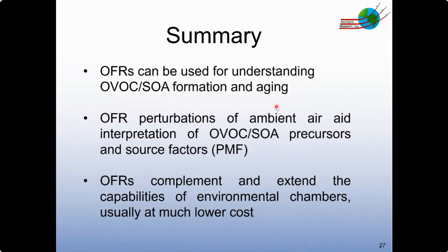For a while, there was some contention in the community as to whether OFRs are better or worse than chambers, and I've joined different sides of that debate. But at this point, I think it's a fair statement to say that rather than necessarily competing with them, they can extend what they do and complement what they do, especially in cases where chambers are just not a viable option to deploy, such as in the field or in lab studies with limited space or limited personnel or budget.